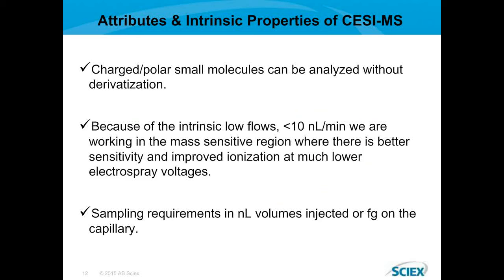Some of the intrinsic properties of CESI also apply to capillary electrophoresis as well. Charged and polar molecules can be analyzed without derivatization. It results in a lot of labor-intensive time saved. The flow rates are very low. They can be under 10 nanoliters per minute.